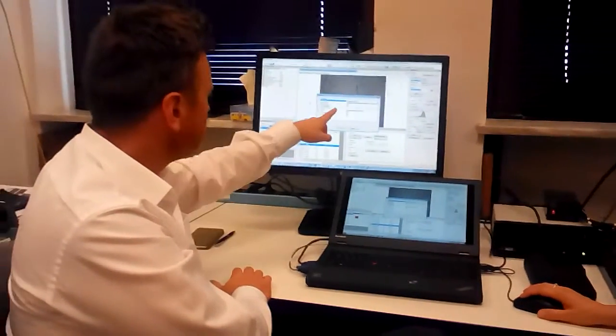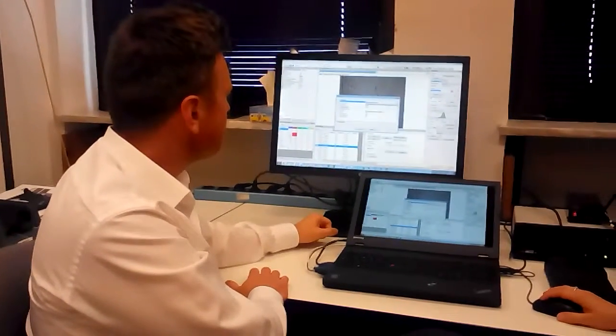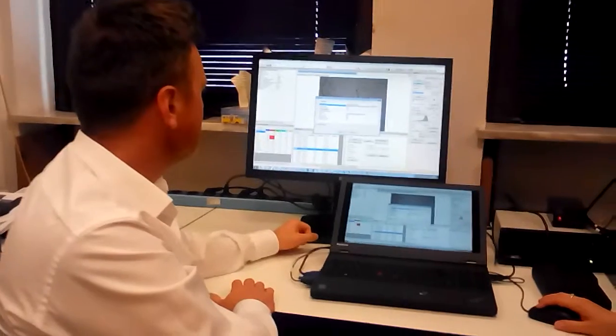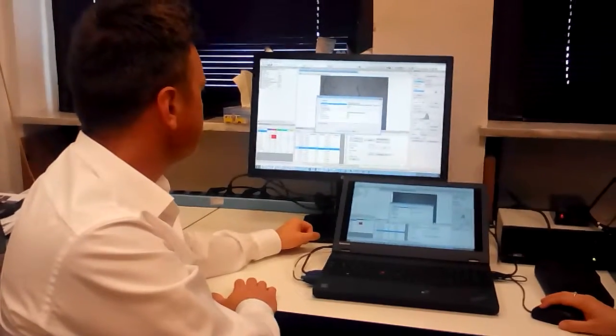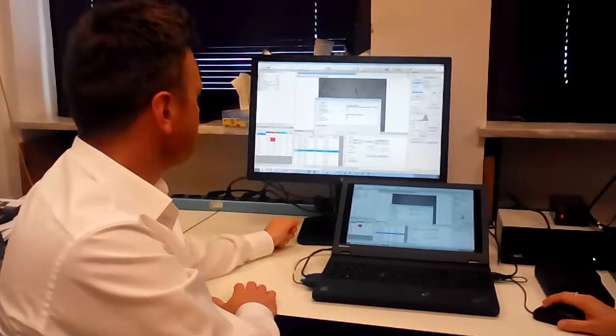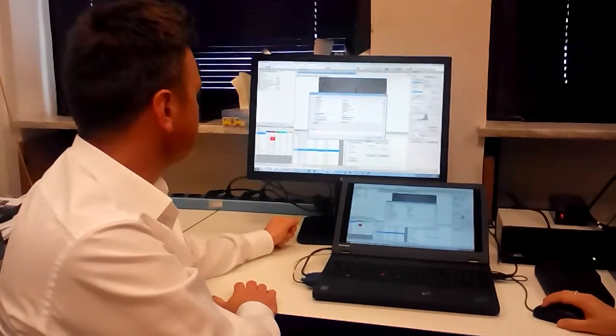So do you have that opened? The layout? The template layout, yeah. The template is done, the details are done, so the report head, we call it report head. Yeah, so it's ready to go.